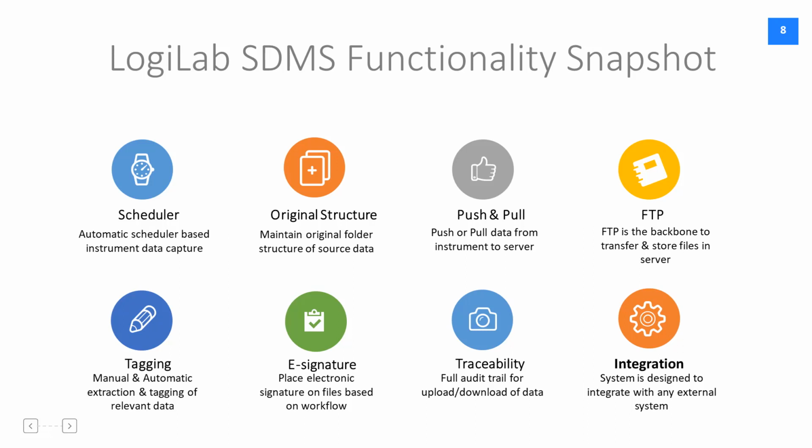There is a 100% log of each and every file that is being uploaded to the system. Even if there are any failures or failed reattempts, the system will audit trail each and every event that is happening inside the system. There is a full traceability of all events within the system with respect to 21 CFR Part 11. Logilab SDMS is also designed for integration with external systems.